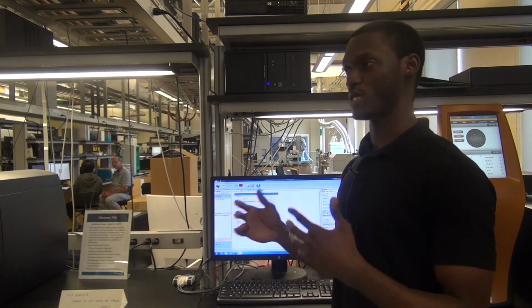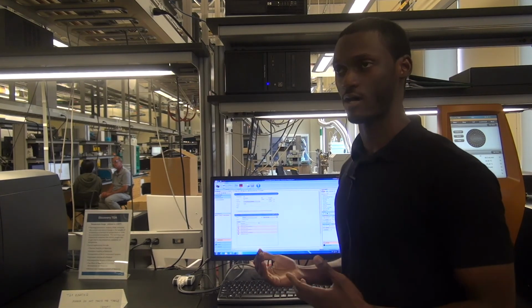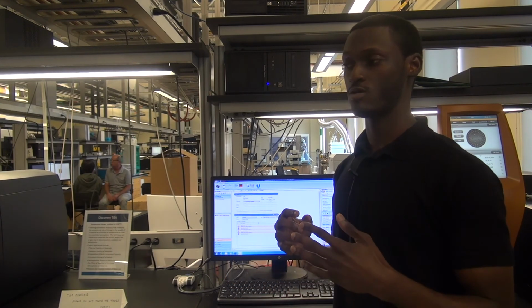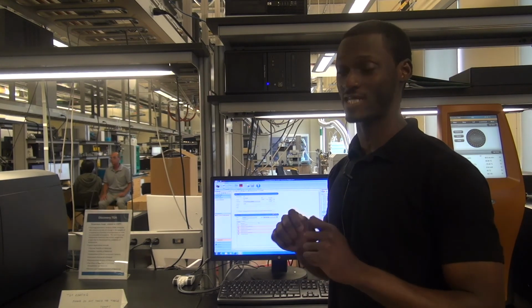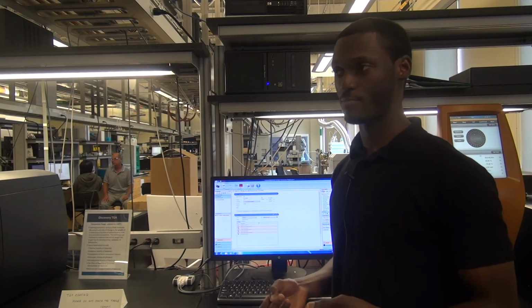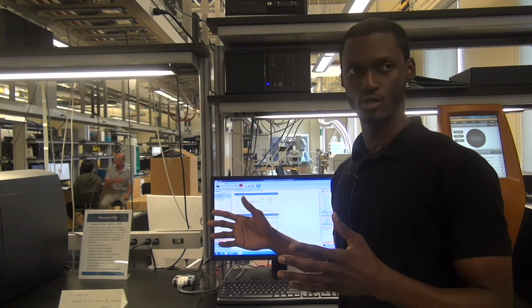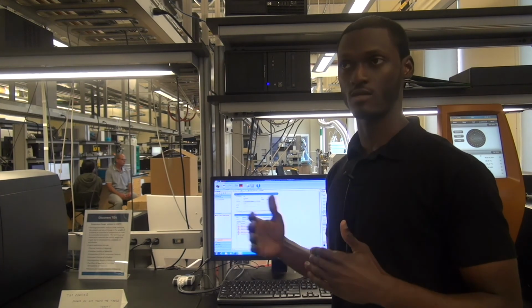So you can possibly change how things look on your data by changing your heating rate. Okay, that's why a lot of times I would tell people not to compare things that you ran on different heating rates unless that was your actual intention. Okay, so if I were to run the same sample with 3 different heating rates, it's very possible I can get three slightly different curves, or they look different, simply because of that thermal gradient issue.